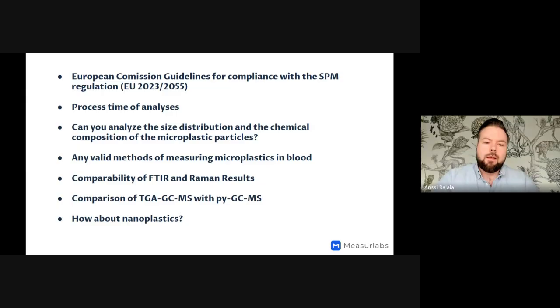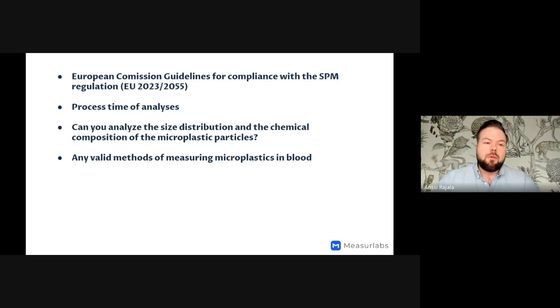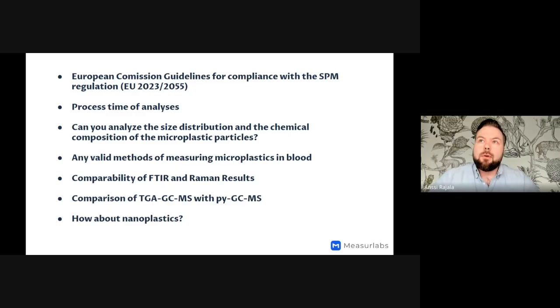If it has sand or something like that, it isn't really a clean water sample anymore. If there is something like sand, then density separation should be used to get the heavier inorganic content away. If it's basically clean water with high ionic compounds, then it can just be filtered and then washed with water after that.